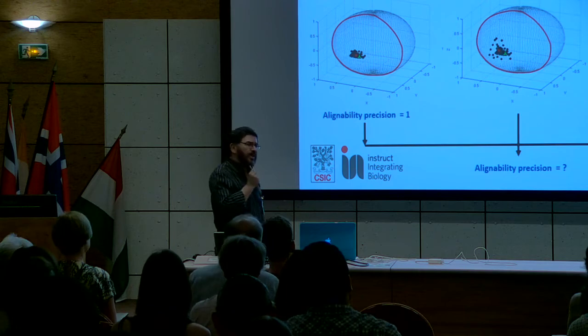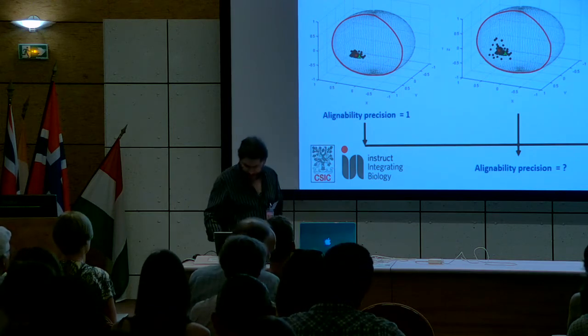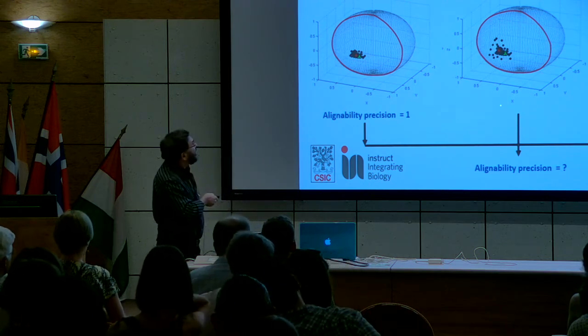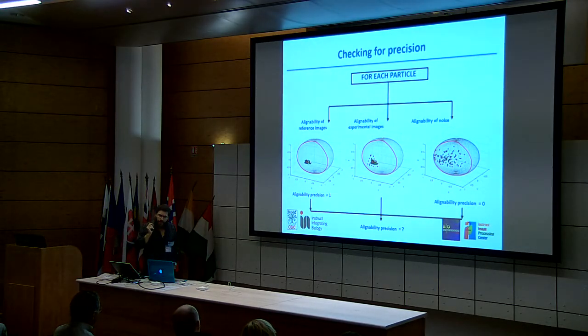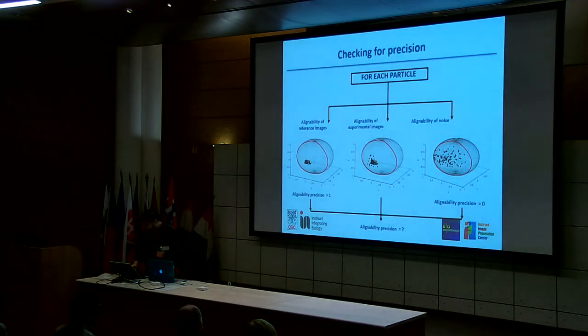This is if I try to do this same analysis, but with the experimental data. You are going to see the impact of having a number that defines precision at the alignment level that runs from 0 to 1. You are going to see that because we are going to apply that number to each of the images, and we are going to try to see what happened. Really, have we been successful aligning the images?